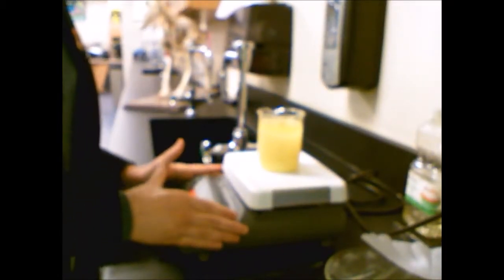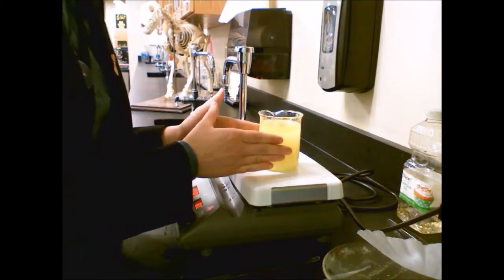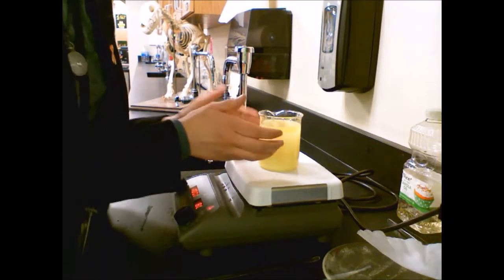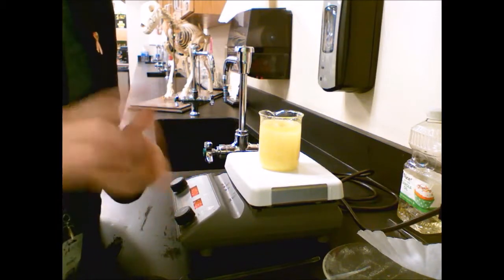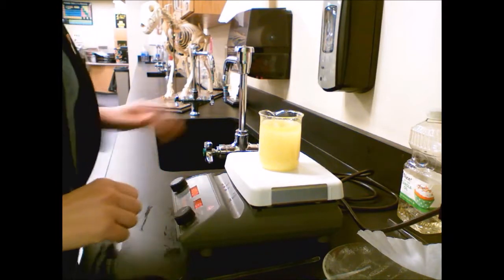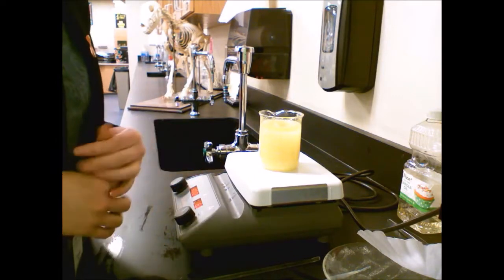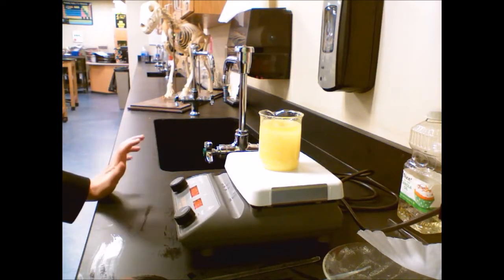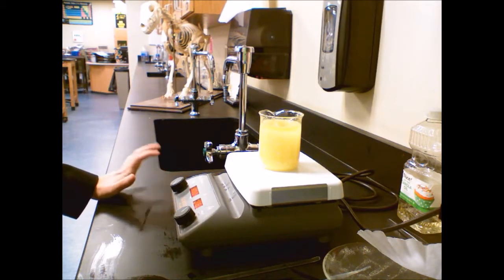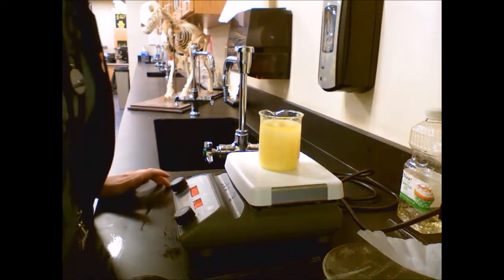So at the moment, this is going to take a while, first to heat up all the way, then to dissolve the sulfur to achieve a supersaturated solution. In the case of the orthorhombic crystals, instead of freezing from a melt at different temperatures as in both other cases, we're going from a supersaturated solution, just like what we did with our copper sulfate. Copper sulfate is an ionic compound, though, so it can dissolve in water. Sulfur is not and can only be dissolved in oil. So we're going to give this a few hours to dissolve. I'm going to do some grating, and we'll get back to this here in a sec.